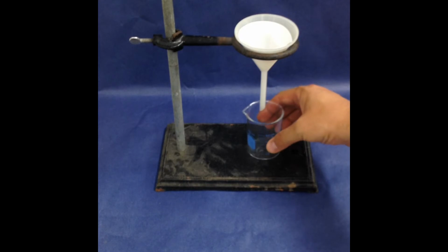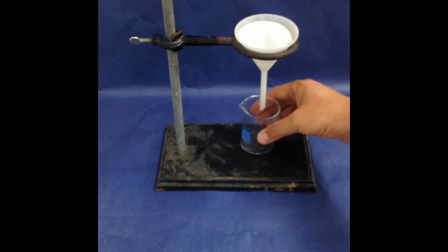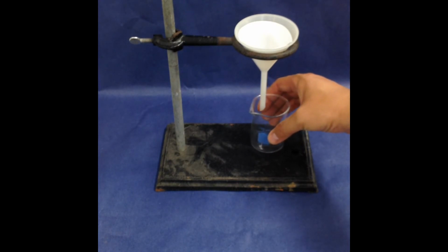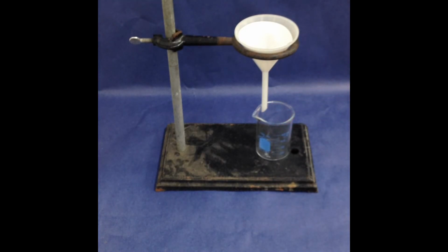In this case, I have a beaker, but it's not uncommon to have an Erlenmeyer flask. All right, so either of those would be appropriate choices to collect the filtrate. And then one other tip is to make sure that the stem is touching the glass. Now, the reason for doing this is so that you don't get any kind of splattering occurring.